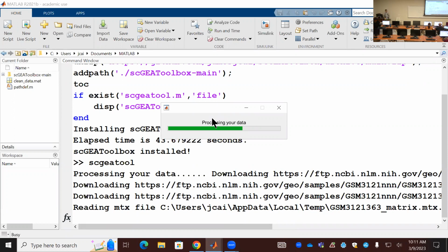So after we process this data, then we will save it, and then we will look at how we can run single cell scTenifoldXct, which Yunjian presented as his package in MATLAB. But that one, we need to install Python. So it's a mixture. I will show you how to do this once we set it up, just like we set up the R environment, then you can call R. But this package was developed in Python, and I have an interface through this tool, but we have to install Python, that package separately.